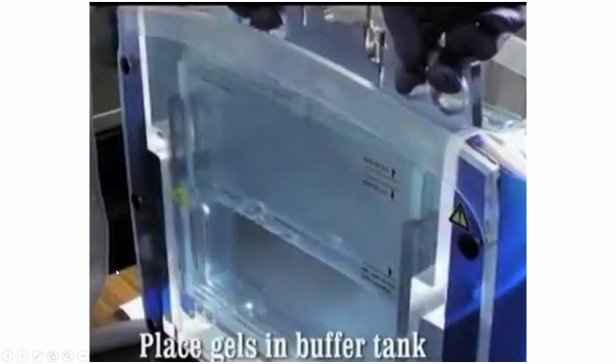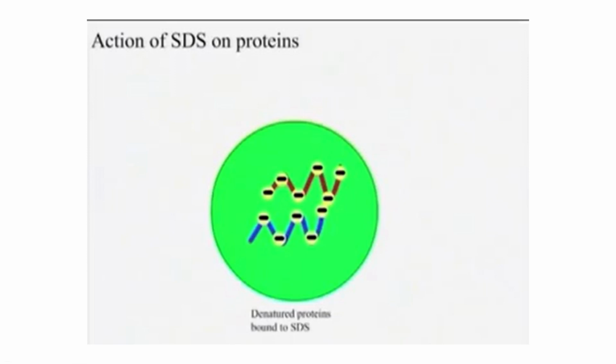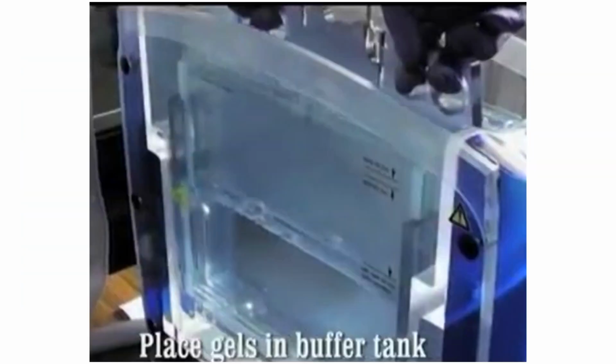If you can see a dark blue stain here, that's nothing but the ladder, which will help you determine the molecular weight. Then you can keep it in the tank buffer. This is how the tank buffer looks. So this is the practical demonstration which sir tried to show.